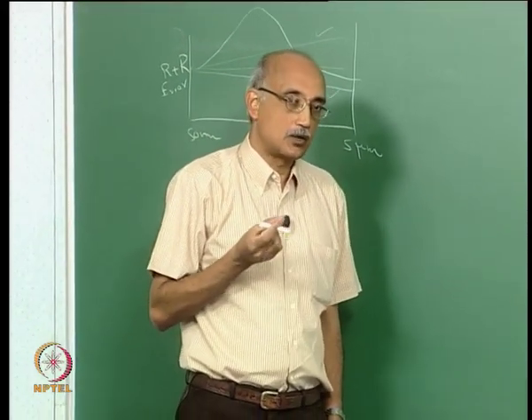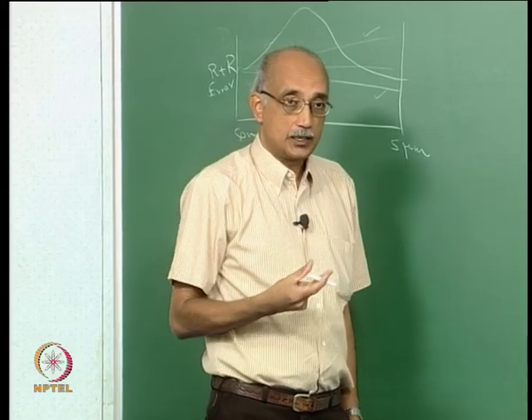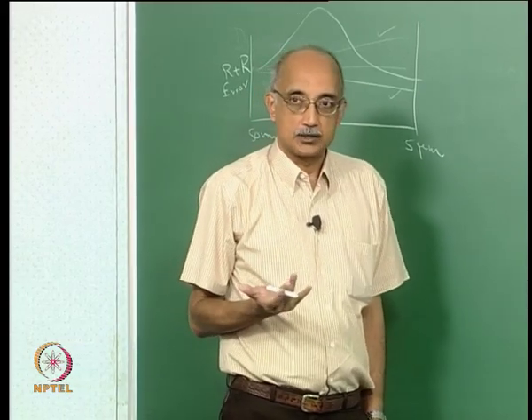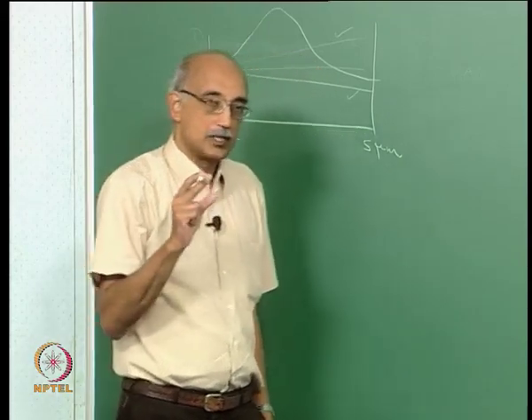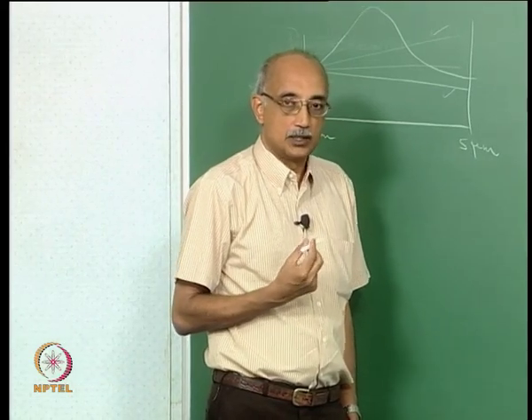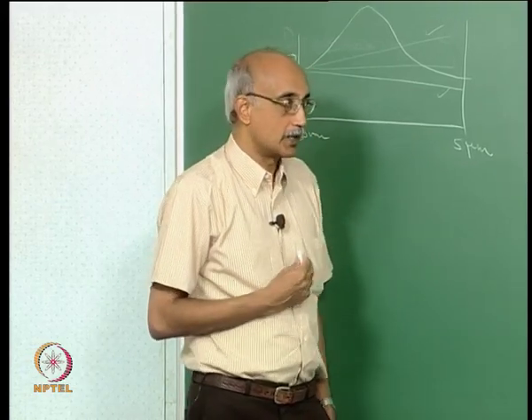then there is something wrong either with the optics of your system or with the software that's being used to analyze the data, or it could be that the particle sample itself really does not lend itself to light scattering analysis. For example, you may be operating in a range of dilution which is too concentrated for a particle scattering type of analyzer to handle. So you're probably better off switching to a different methodology altogether to evaluate the sample rather than using light scattering as a technique.